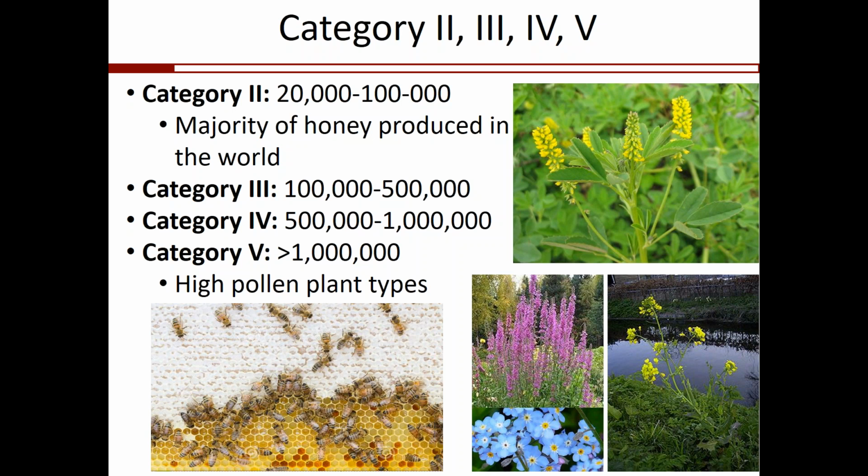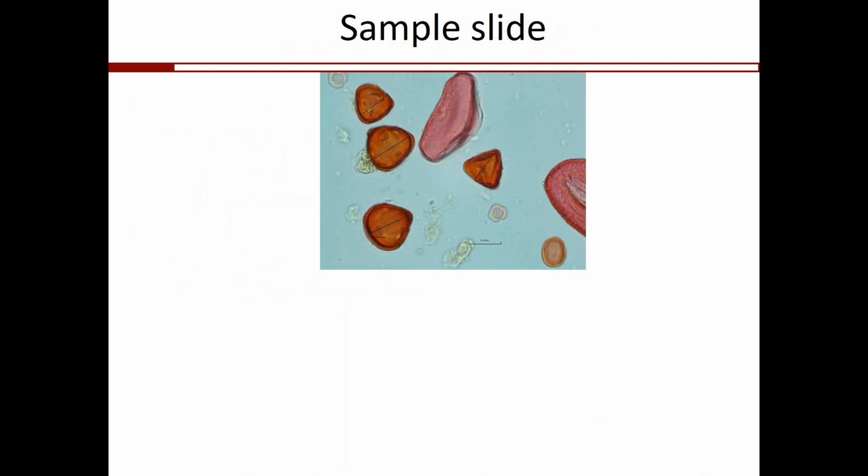It can also be from honey where there were pollen cells in the frame with the honey itself. So when beekeepers extract the honey and put it in a centrifuge and spin it out, the pollen in the cells can come out as well, and that can increase the pollen concentration in your honey sample and affect the true pollen concentration of what your honey was.